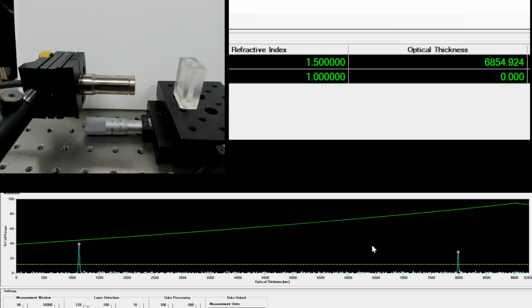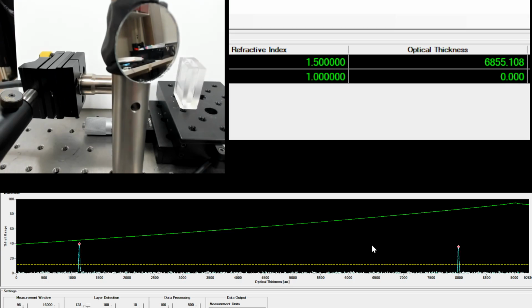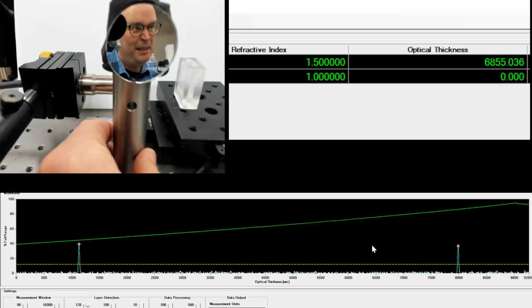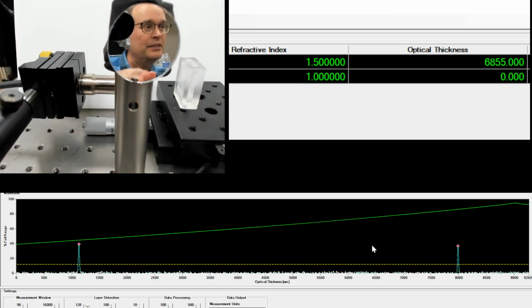Okay, again, this is David Comperator from the lab at Lumetrics, showing you how to use the OptiGauge to potentially measure the concentration level of salt in a saline mix that you're creating.